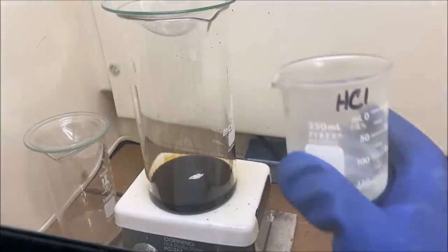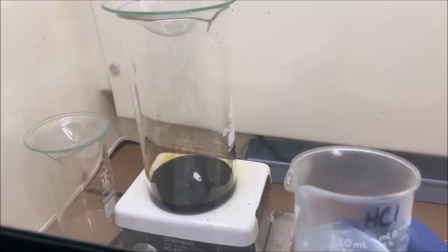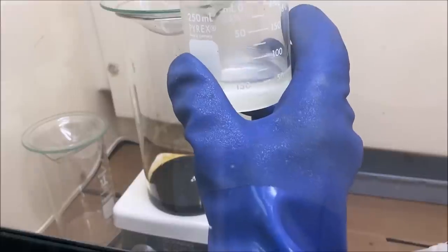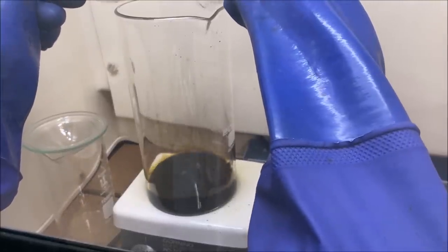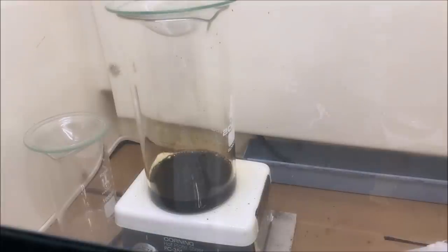What that tells me is that the excess nitric, if any, has been consumed by the reaction or driven away as we evaporated the solution down to a syrup. So here we go. I've got 50 milliliters left. I'm just going to add it right on in. Hydrochloric acid.